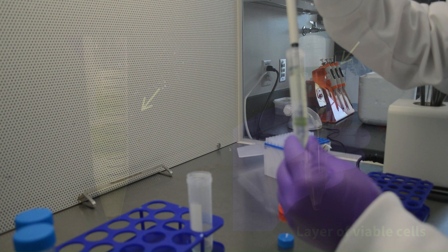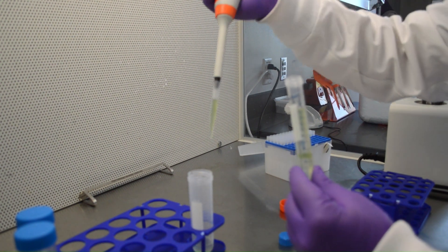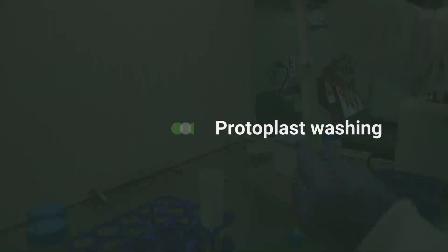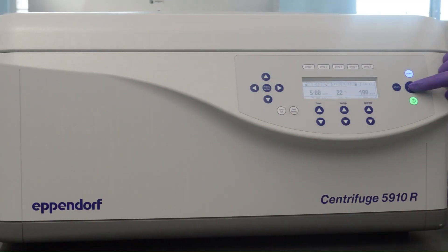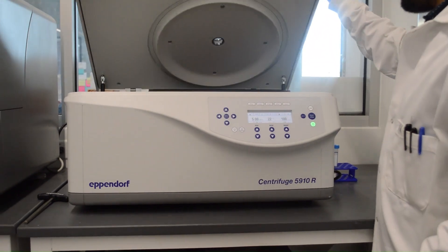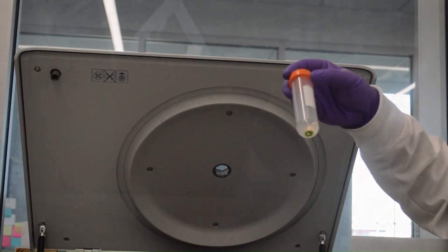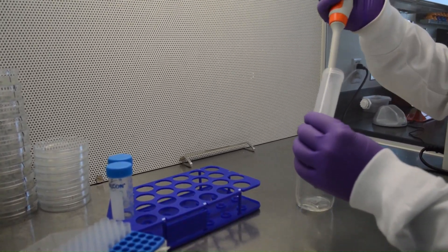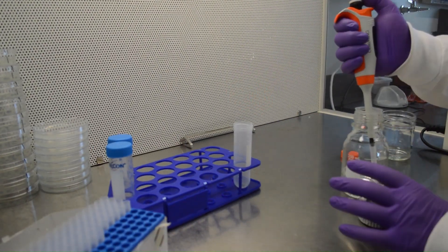Transfer the viable cells into 5 milliliters wash buffer. Centrifuge the tube at 100 RCF for 5 minutes. Discard the supernatant and re-suspend the protoplasts in 200 microliter MMG buffer.